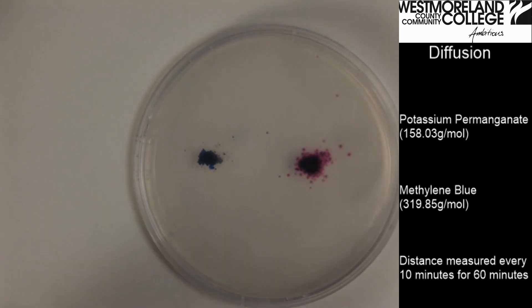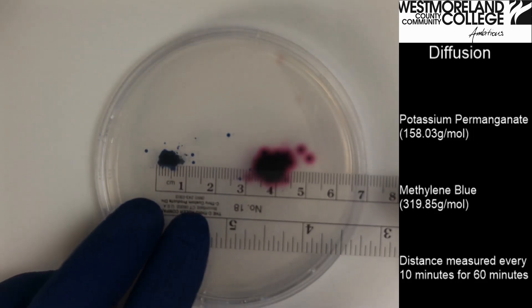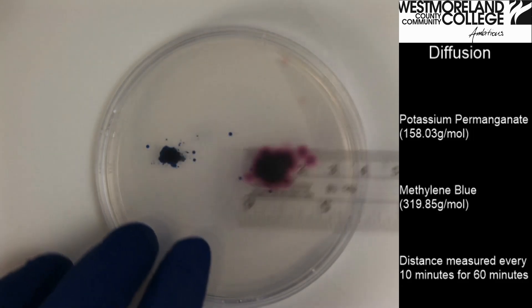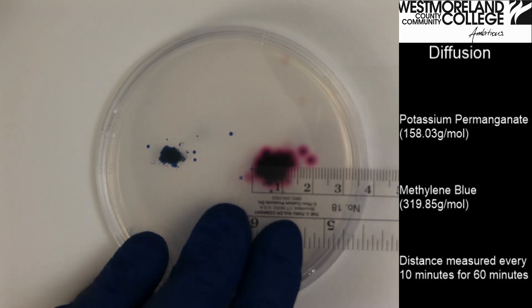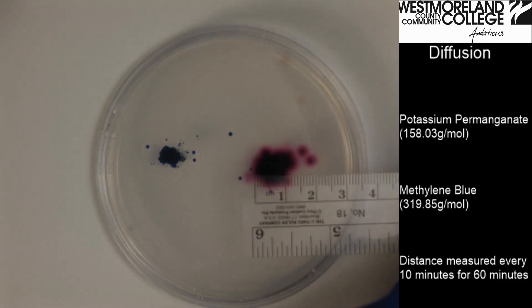Now we set a timer and measure every ten minutes. It has been ten minutes. The methylene blue is at nine millimeters, and the potassium permanganate is at 15 millimeters. I will record my data and then measure again in ten minutes.